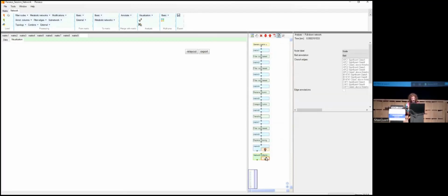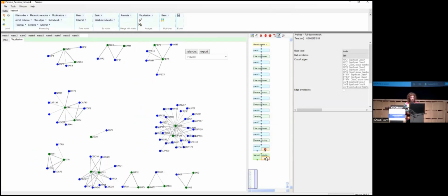Yeah, now you will see. And here it is. So now we represented all the interactions that we saw in the previous volcano plots. As you can see, in the green color, we have the baits that were used, and then in blue, we have their interactors. Just to give an idea that this makes sense, we are actually looking at what we saw before in the volcano plots. Let's check these two proteins. You can see these two baits, they have a lot of interactors.